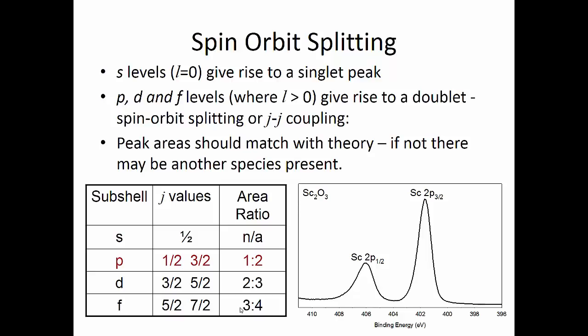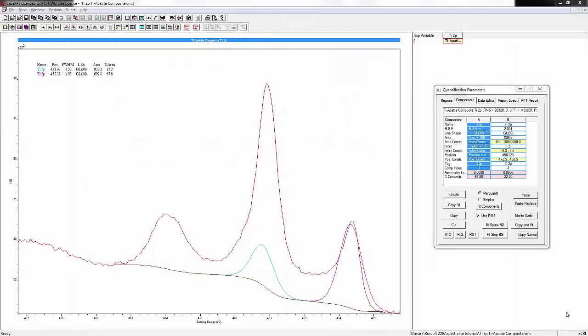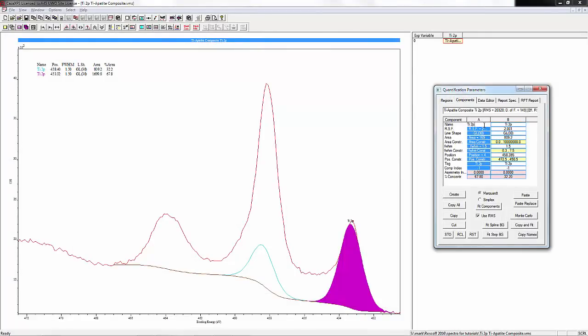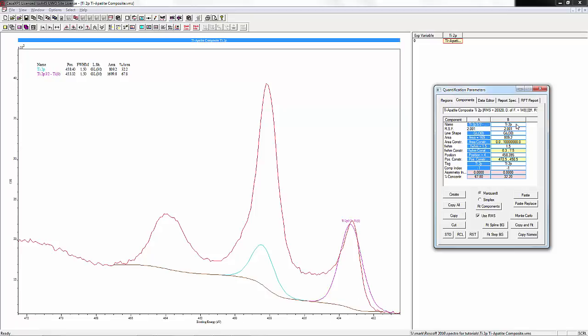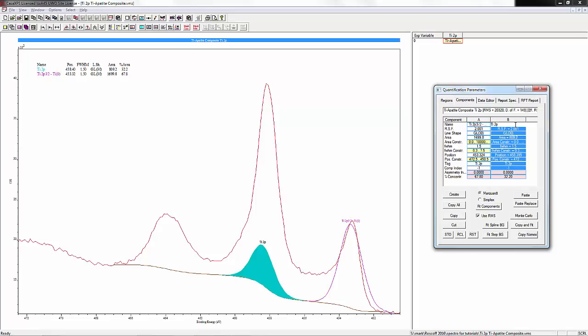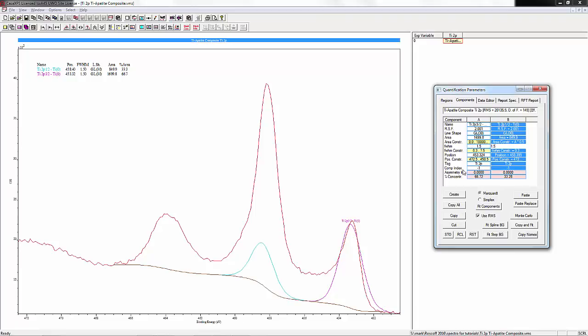Back at our spectrum, if we start fitting these, this will be our titanium 2p3/2 peak for metallic titanium, and this will be our titanium 2p1/2 peak for metallic titanium. The area ratio between the 3/2 and the 1/2 has to be 2 to 1, so we're going to make it that this is A times 0.5, or half of the area of this peak.